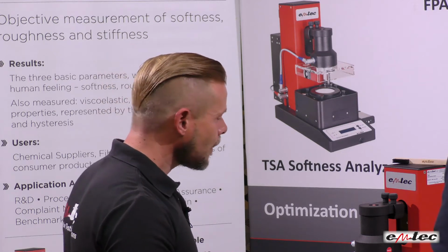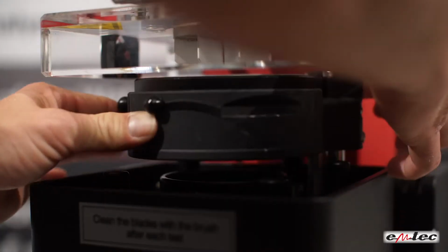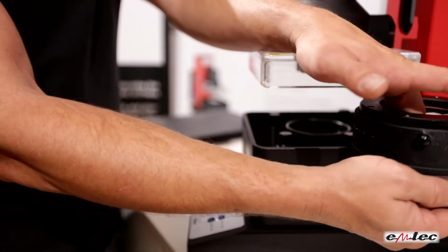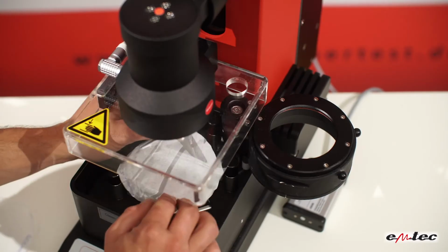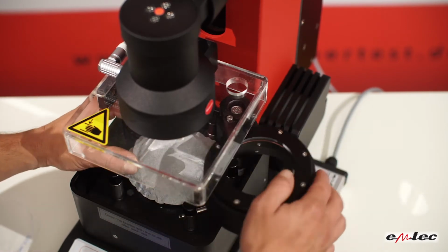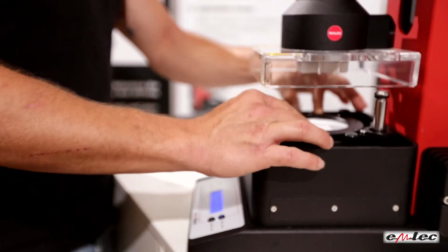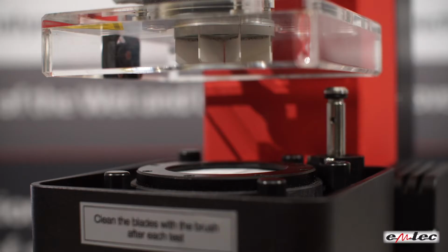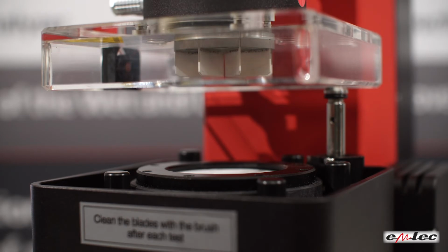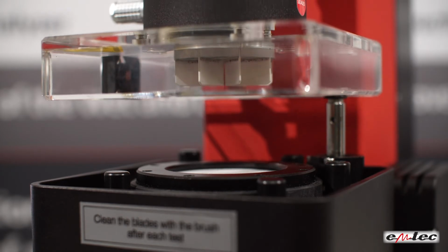Okay. Now, after the measurement, the measuring head comes back up. The sample has to be taken out. The plastic film has to be removed, and only the sample has to be brought back into the instrument. The fixing ring is closed again. You lock the handles again. And now in the software, we push start, and the second step of the measurement starts.